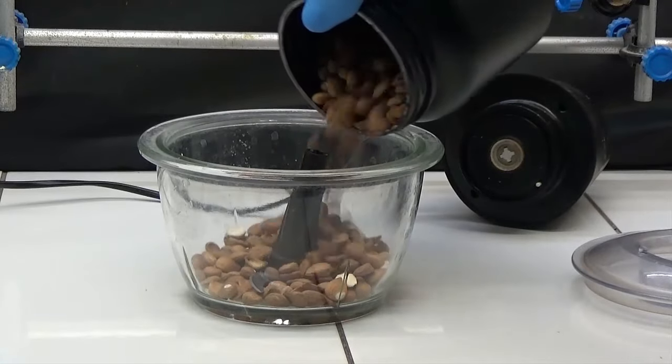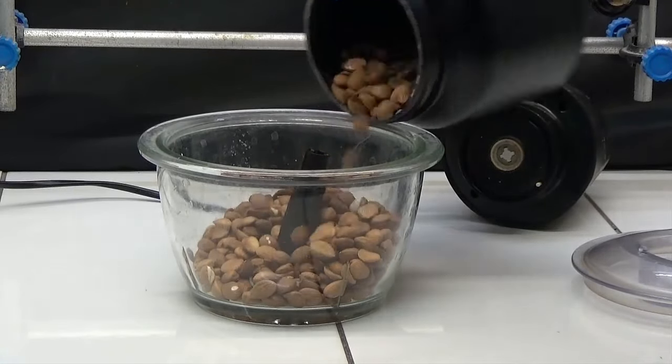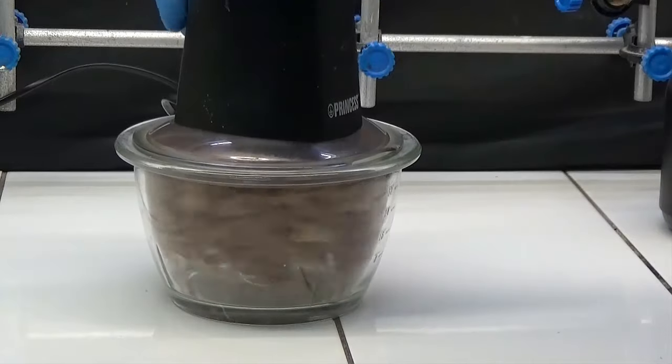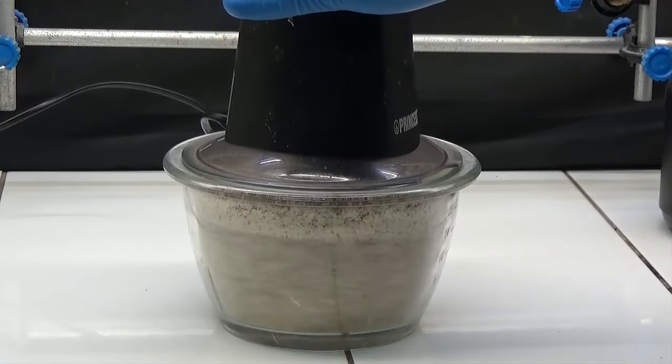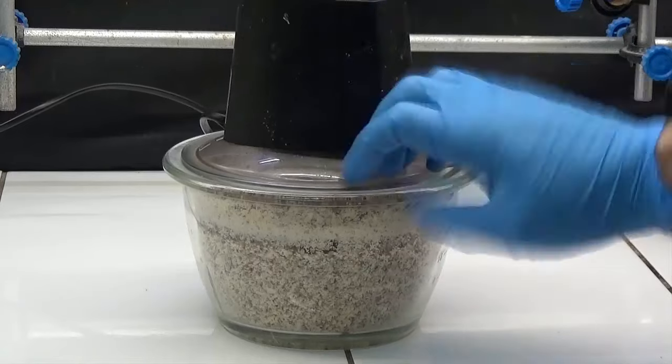We dried the seeds in a 60 degree oven for 24 hours. Crush approximately 150 grams of dry seeds.